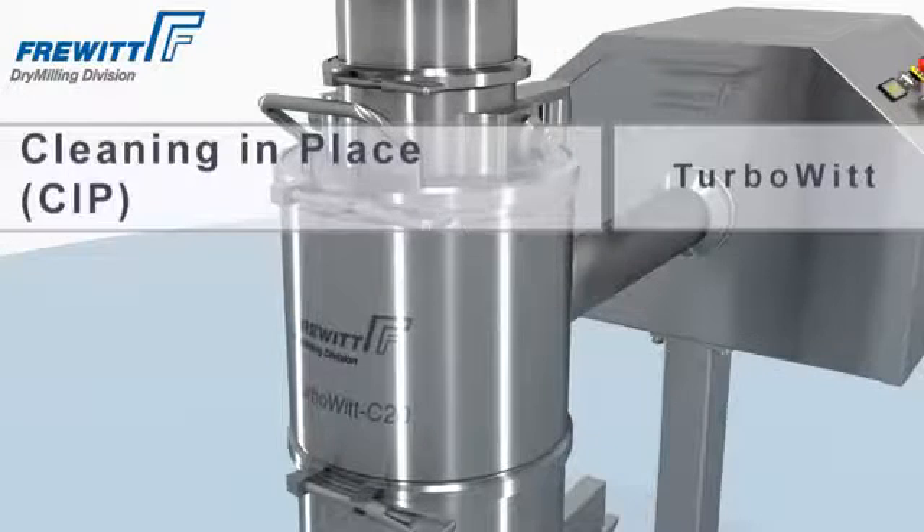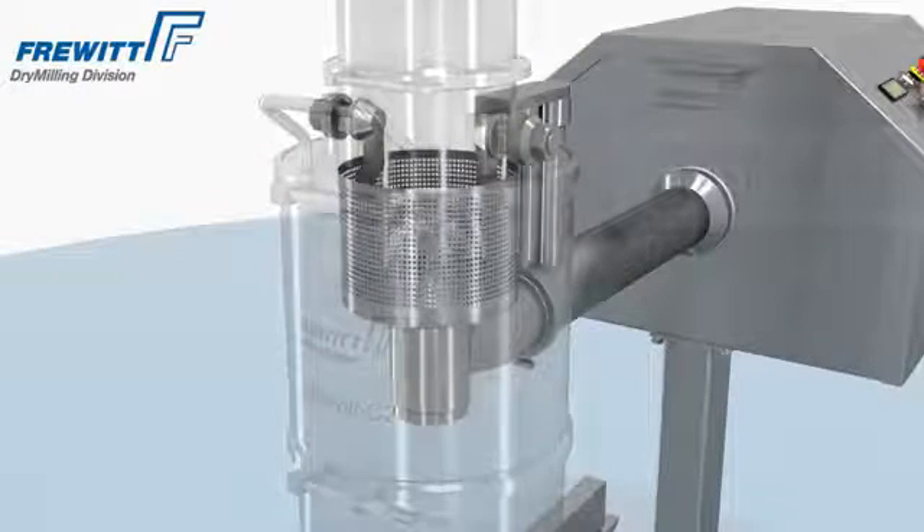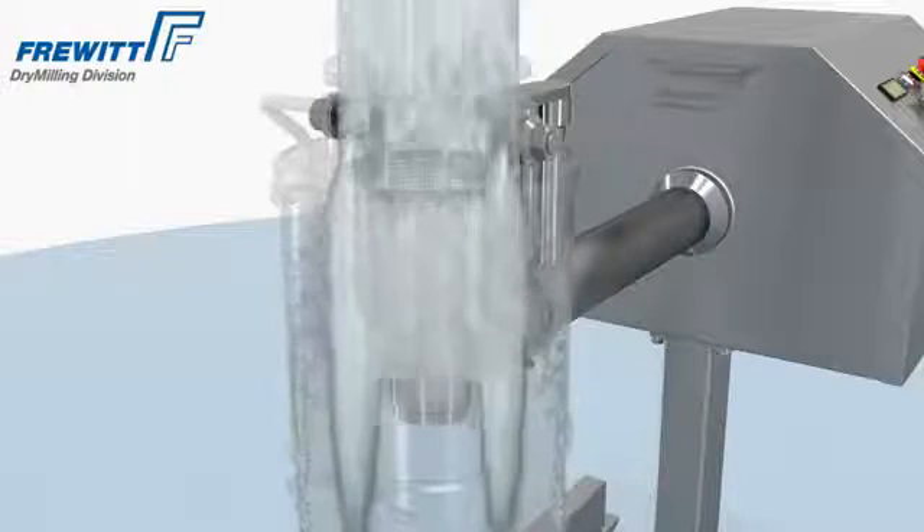CIP — cleaning in place — is the fast and reliable process to remove all contamination from the TurboWitt system.